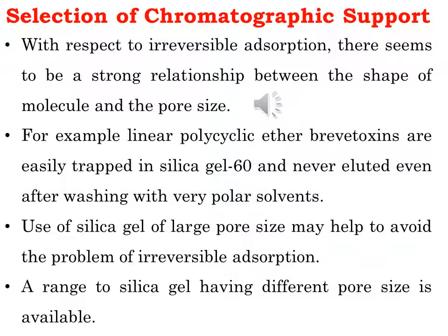Fortunately, C18 and other reverse phase columns, which can be used for the separation of water-soluble compounds with greater success, are now widely available. They include matrices such as polystyrene and divinyl benzene and hydroxyethyl methacrylate dimethacrylate copolymers with various functional groups. Recovery rates are generally much better on these polymeric materials and are accompanied by much longer column life.